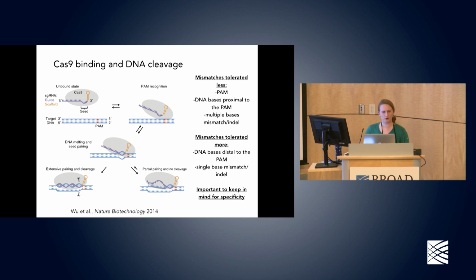Again, these are important to keep in mind for specificity, and when choosing a guide, you can see that predicted off-target cleavage occurs at targets that seem to line up with some of these suggestions.